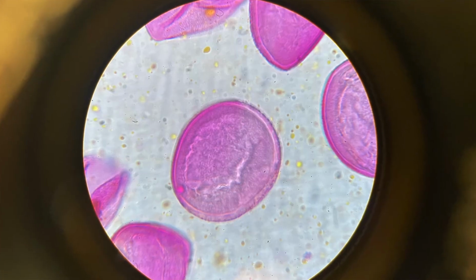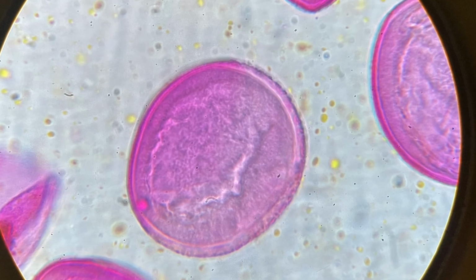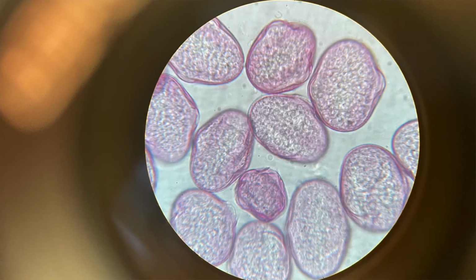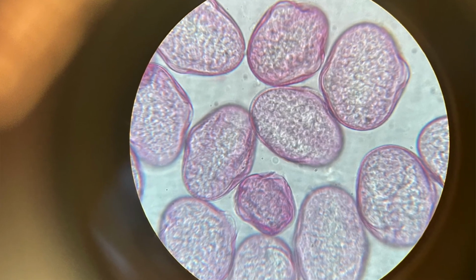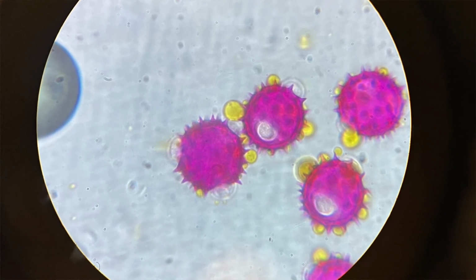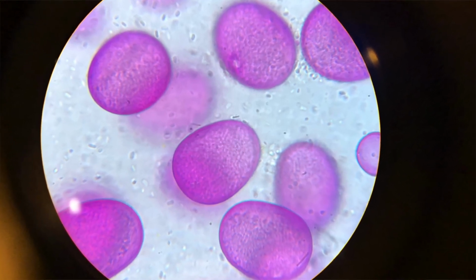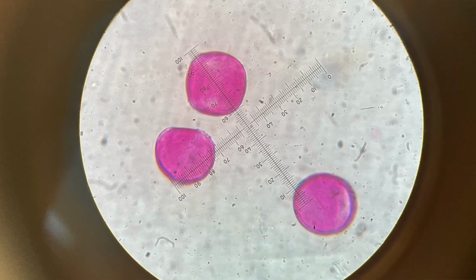So yeah, that's the third really interesting point regarding bee pollen microscopic observation, and that is really fascinating. There are quite a few websites talking about that. If you want more information, I'm sure you can find it all on the web. So I just wanted to briefly mention this and the value of it. And if you really love bees and you love nature and so on, and you have bees, you should do this. This is so fascinating, so nice to do.